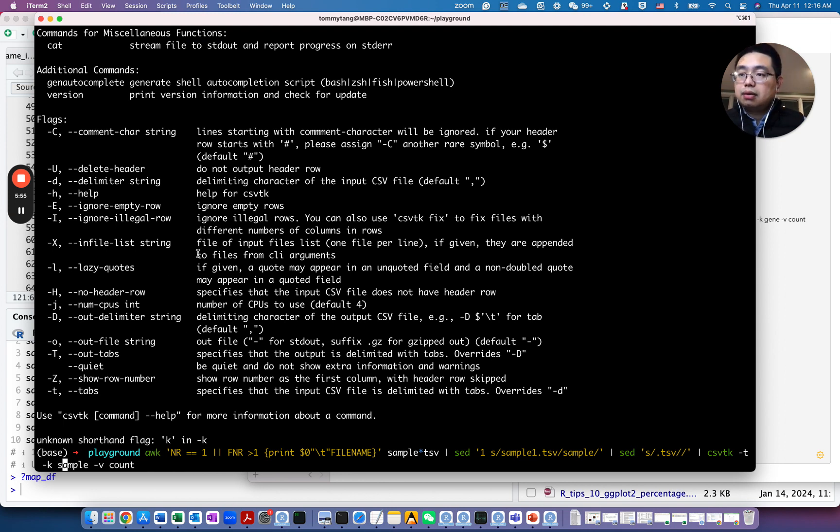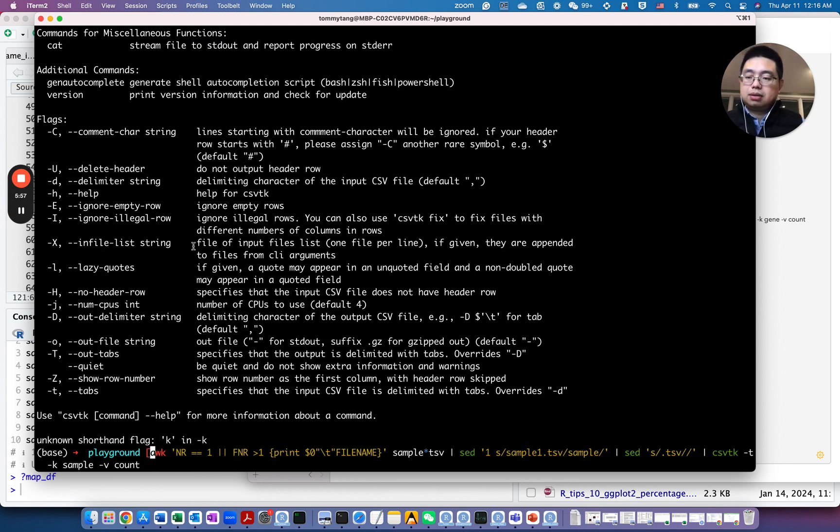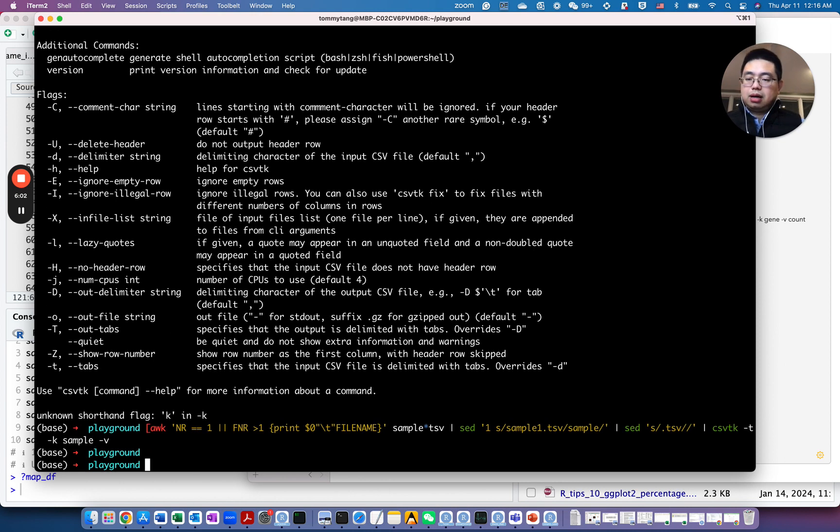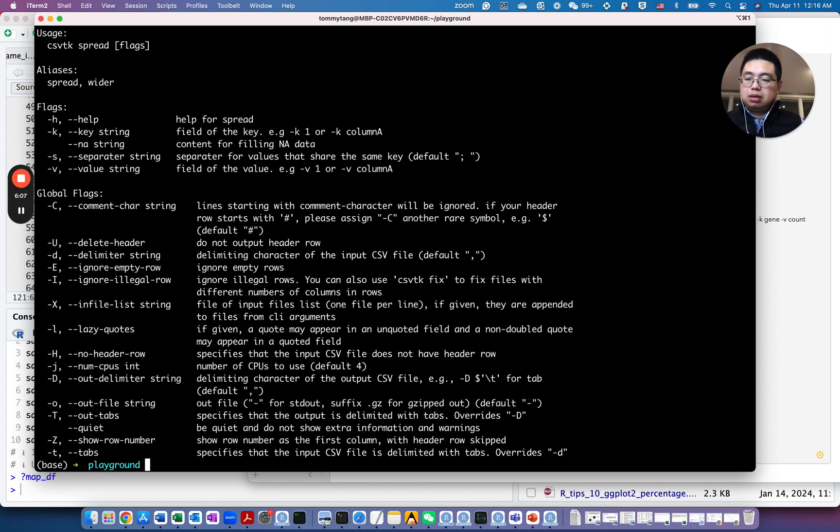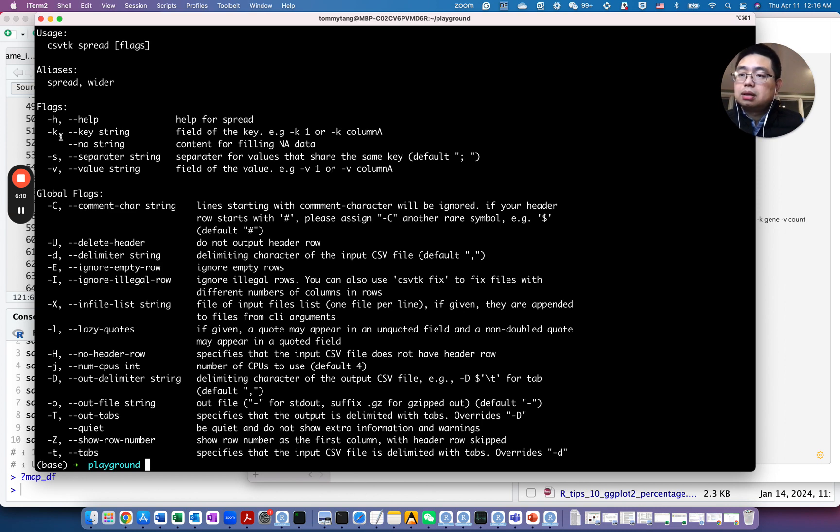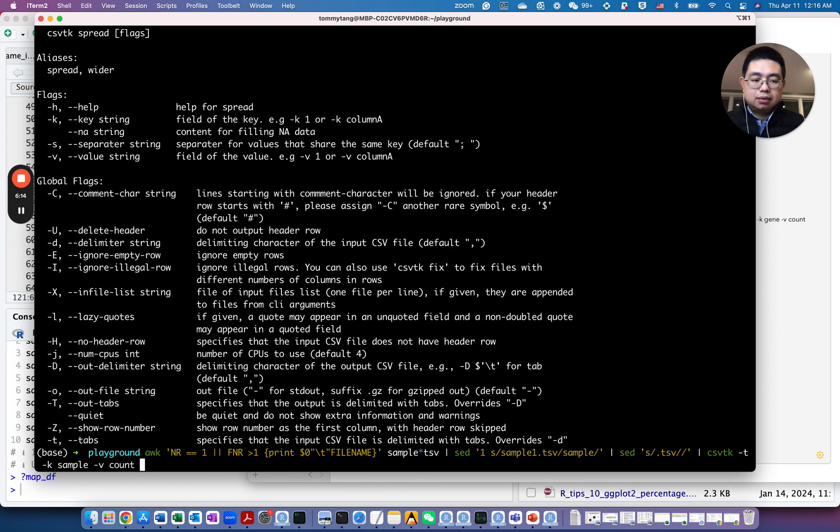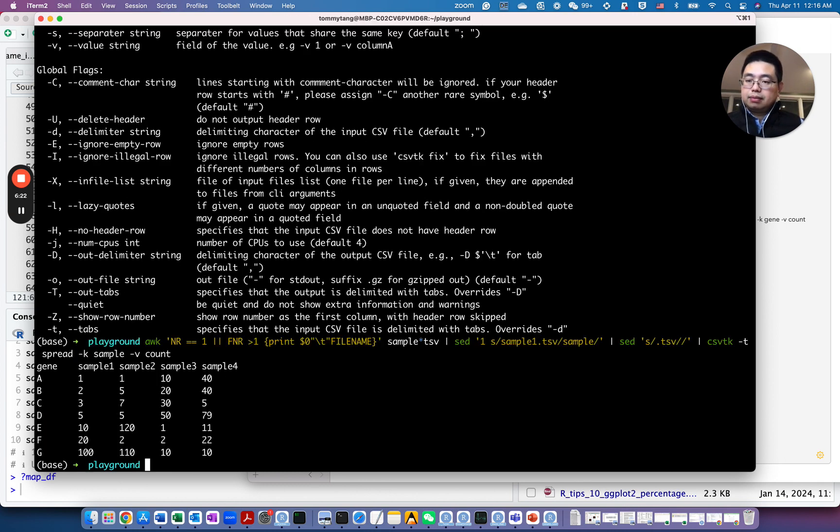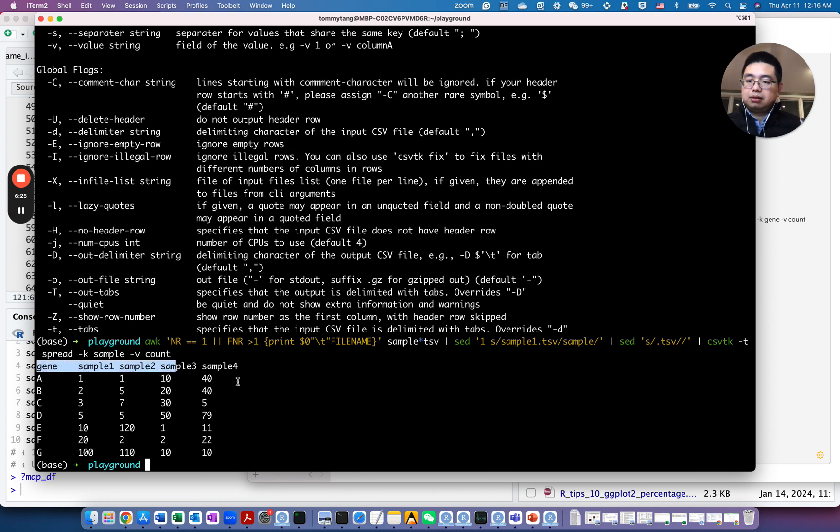Oops. Let's look at the help for csv-tk spread. The key and the value. Yeah, that's right. Oh, so I forget to specify the sub command called spread. So now we have this file.